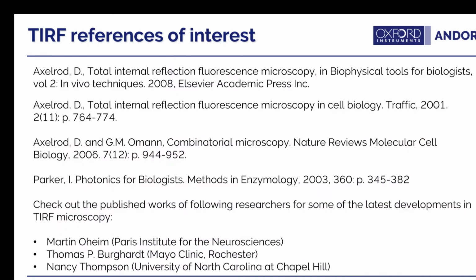And here I leave you with a few references of interest related to TIRF microscopy. All of the review papers by Dan Axelrod should be considered essential reading. The book chapter by Parker in Methods in Enzymology provides some very practical advice for learning to work with optomechanical prototyping parts and even building your own TIRF microscope. And to get up-to-date information on the latest developments for this imaging technique, I would recommend the published works of the three researchers listed at the bottom of this slide.